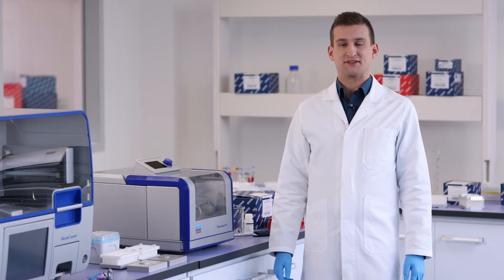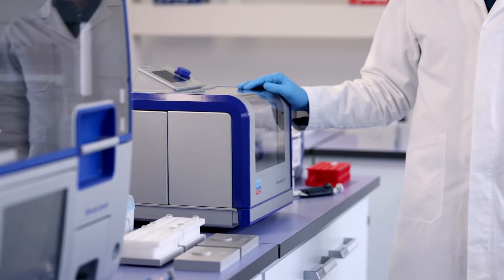Today I'll be showing you how to install the Tissalizer 3 and how to run your first sample.